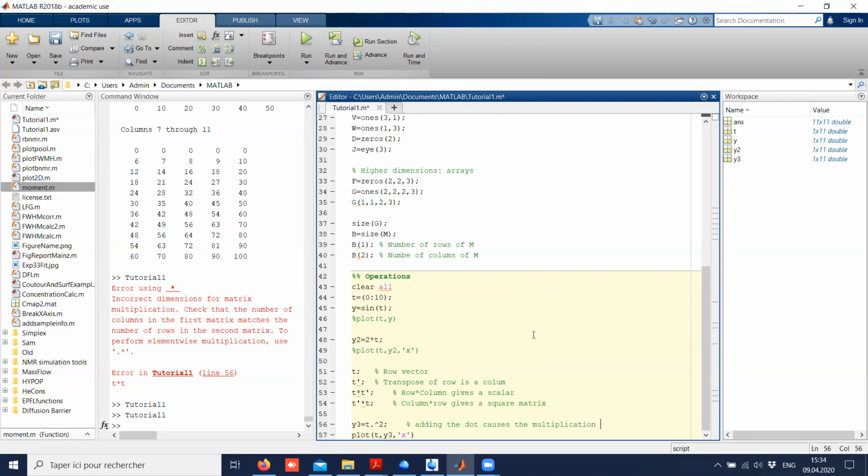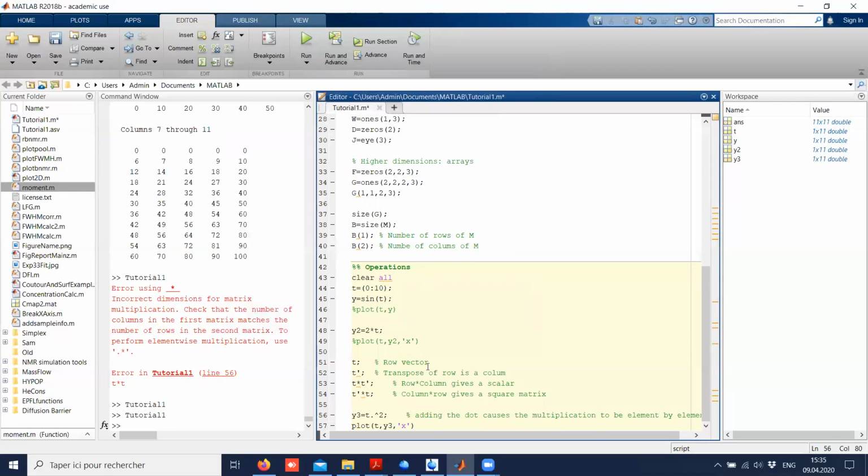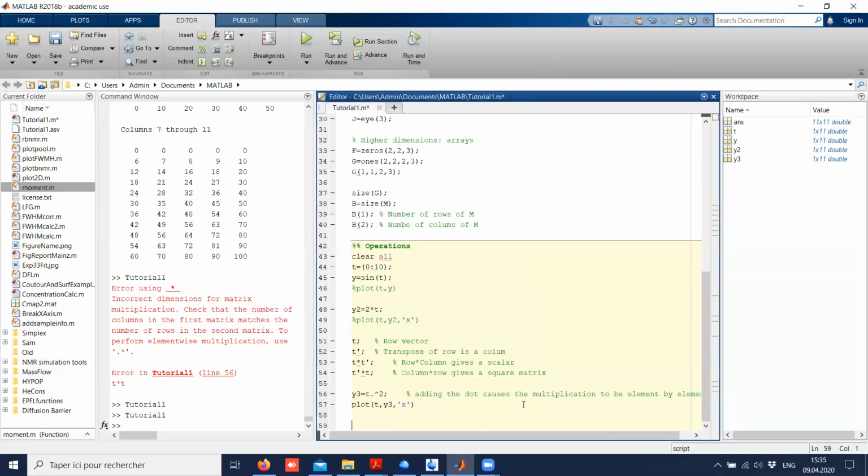Yes, you can. I've just discovered this, in fact. I'll just write this and then I will show you. Yes, you can. It's not the most usual thing to do in Matlab. But then you have to use fplot.